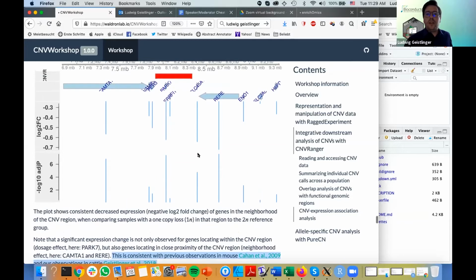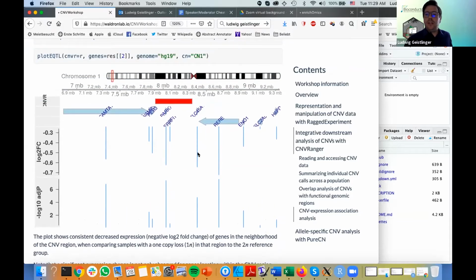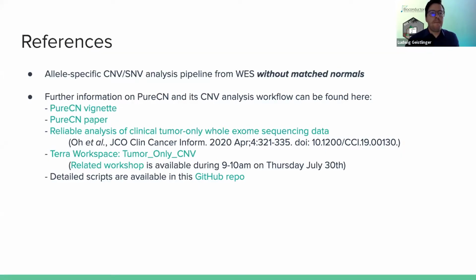Okay, with this, I would stop here and let you share your screen, Sehyun. So till now, we saw how to work on CNV data itself. And there was a really good segue, because one of the questions is whether there is any Bioconductor package that can do CNV de novo discovery. This is exactly the section for that.